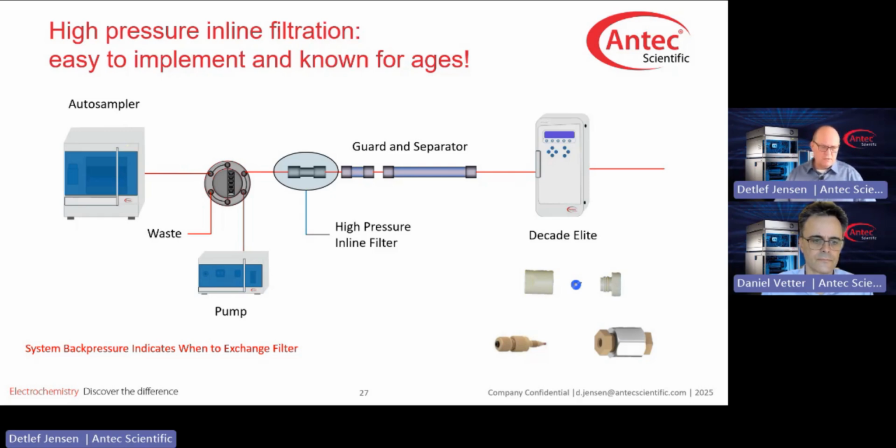So these filters come in different brands and different flavors. But whatever you do is driven by the particles.